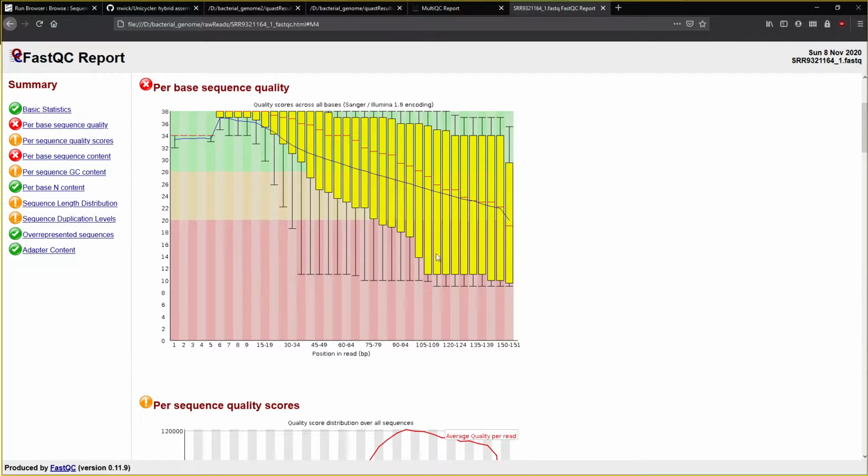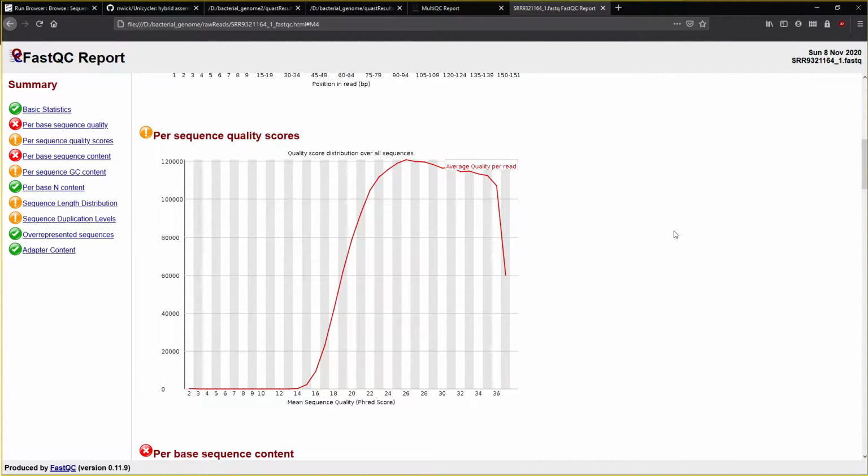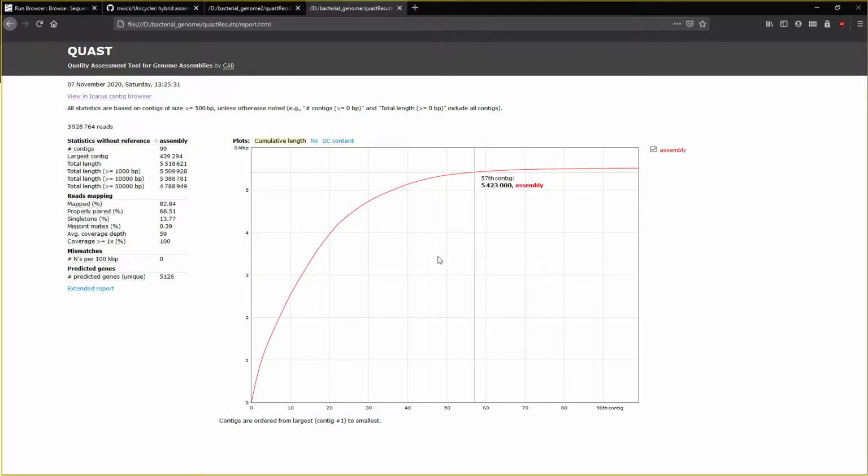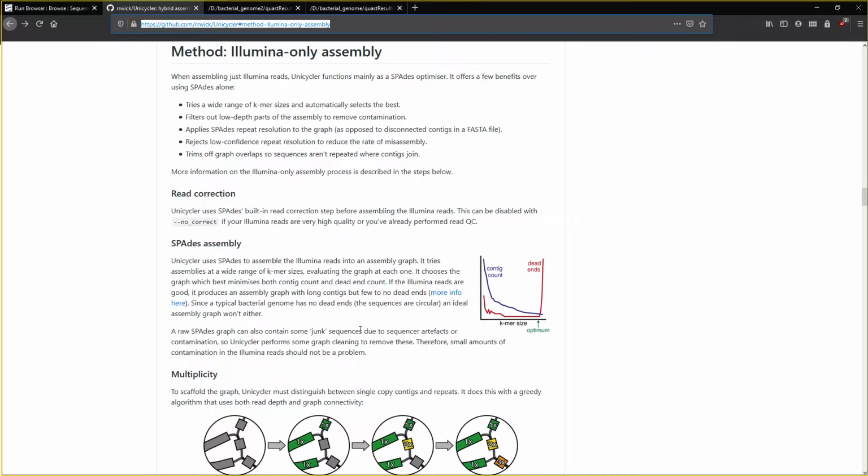But otherwise, it looks fairly good. When we remove reads, we're going to set it at 25, so we'll get some really short ones in here, but like I mentioned, we'll be more confident that the final assembly is of better quality than keeping all of the reads, which could introduce some more error in the assembly anyway. So you can see that's the final result.